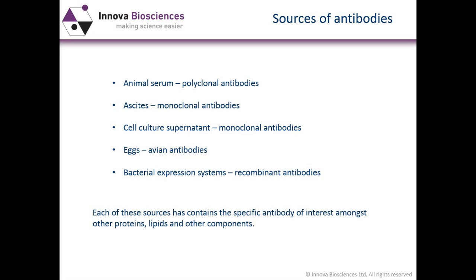That's great. Thank you very much, Claudina, and good afternoon to everybody for our webinar about antibody purification. As Claudina said, I'd like to start just very briefly talking about different sources of antibodies to put some of those into context. And this slide just summarizes probably the most common sources of antibodies that people will come across. The first is animal serum, really from any species that's commonly used to raise polyclonal antibodies, perhaps typically rabbits or sheep or goats, etc.